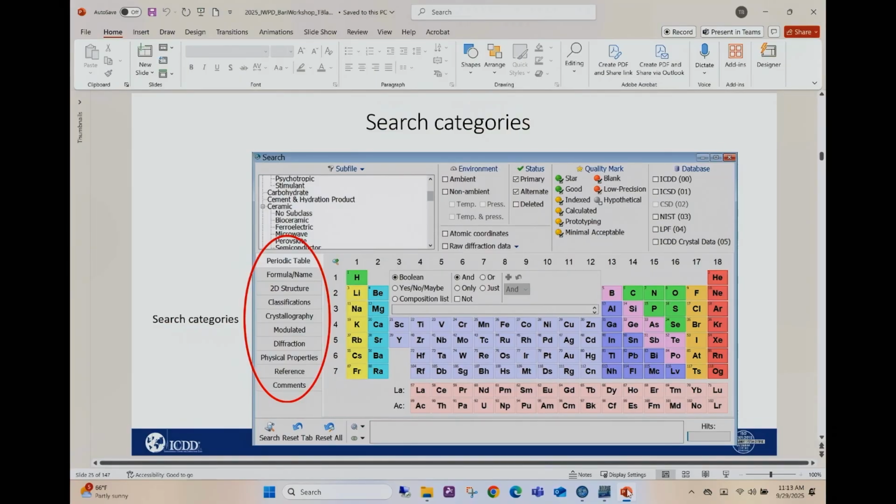If you've made this little subfile, directly no, but indirectly yes, because in your diffractometer software, EVA, HighScore, SmartLab, you can go in and set some parameters to say I'm interested in these particular kinds of phases. I will say the PDF database does a whole lot more, but it's designed a little differently.